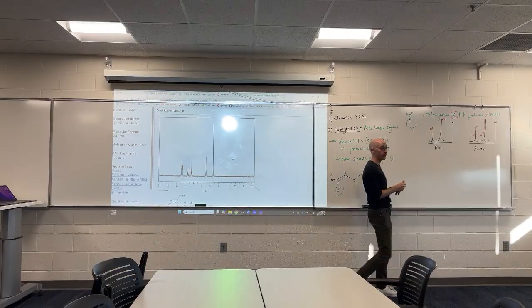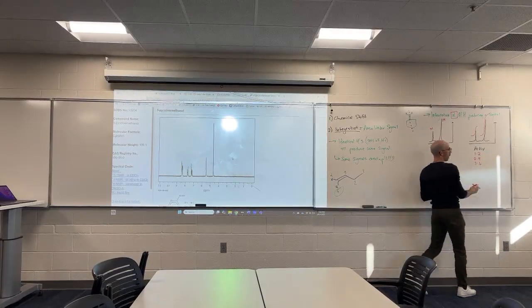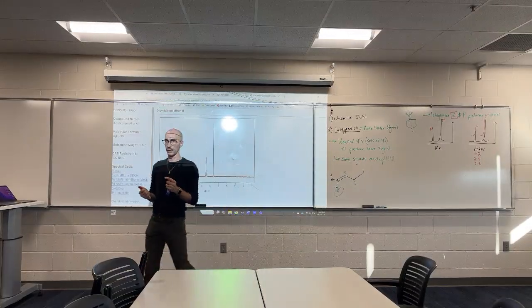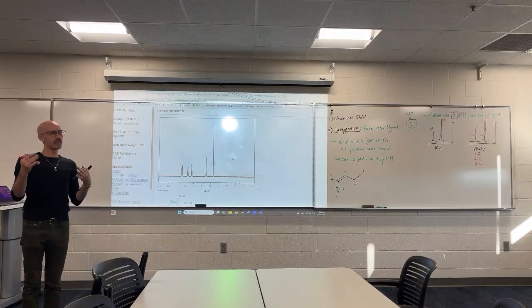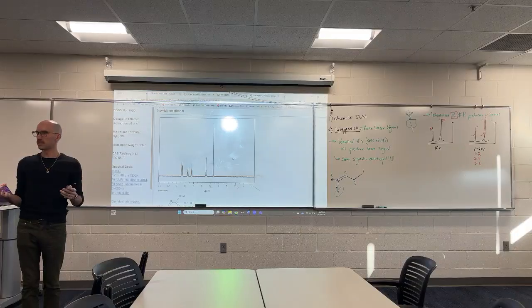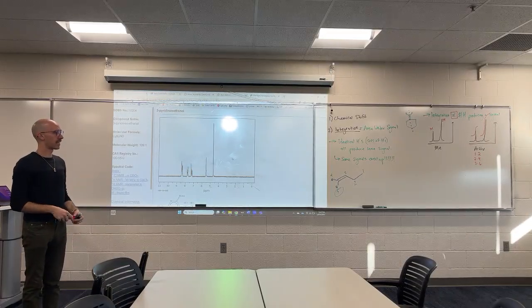Based on these curves, this could be a 1 to 2, a 2 to 4, a 3 to 6. There's no way of knowing, unless you have the chemical formula handy, and then you know how many total hydrogens you have to work with anyways. And then you can figure out what makes the most sense.